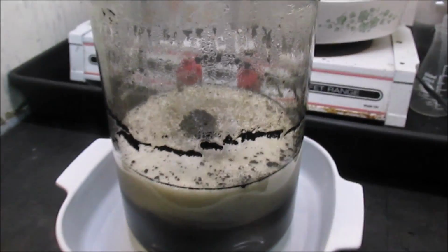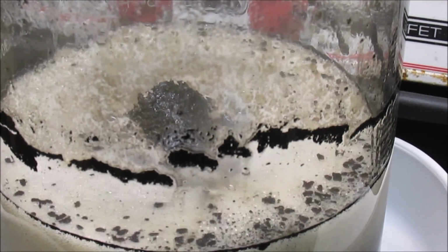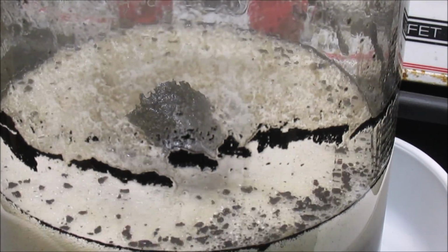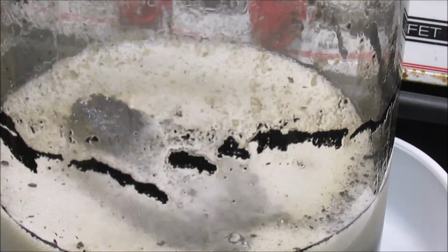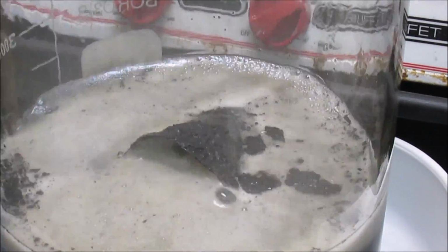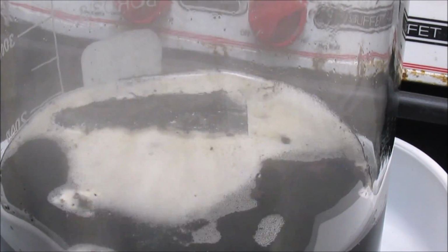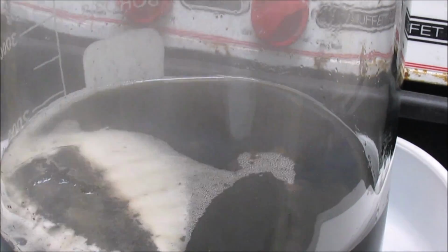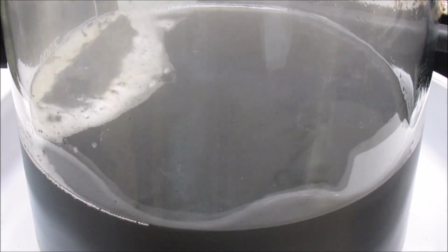In this footage here, that's the first piece of zinc that I put in. I think I take a squirt bottle and squirt down the edges of the beaker here so you can see better, but it only took about 5 minutes, maybe 6 at the most, for the solution to completely dissolve that sheet of pure zinc.